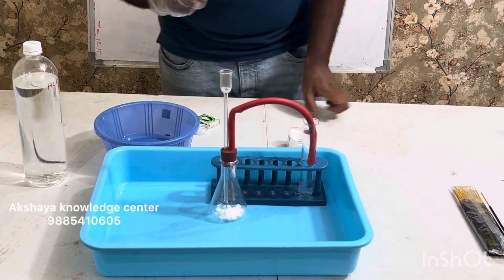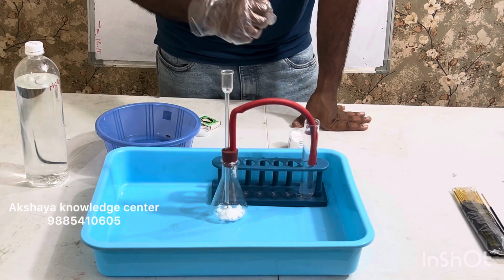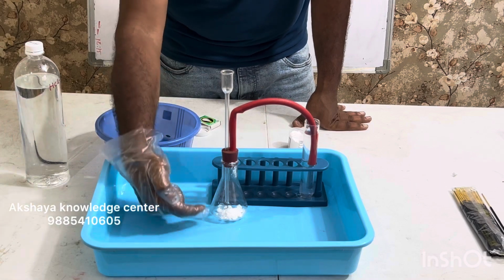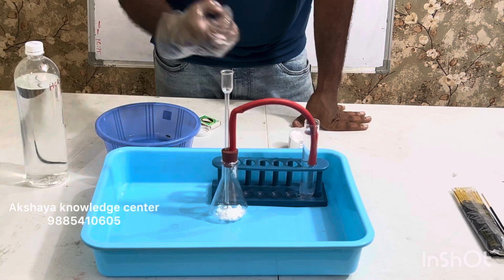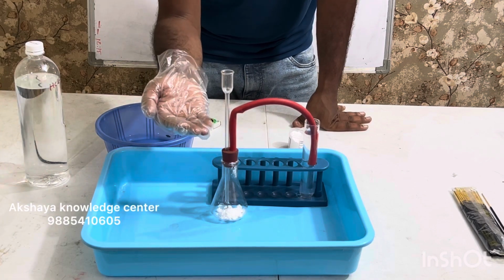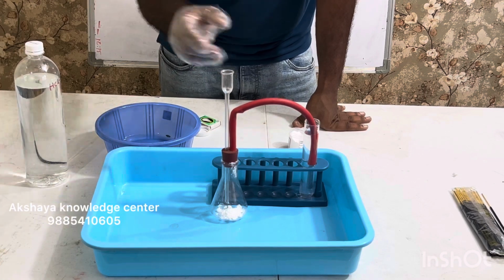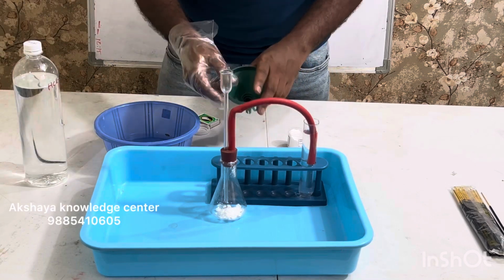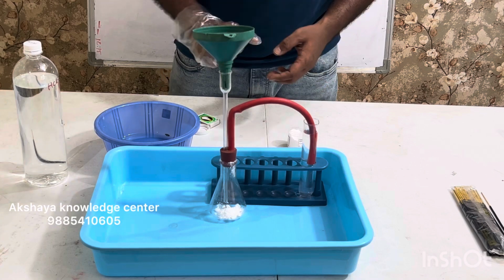You might be wondering, will there be any gas coming from the thistle funnel? Yes, there will definitely be some gas coming from the thistle funnel, but since the funnel is very, very deep into the conical flask, little gas would come out. If I keep the stem of this thistle funnel way upwards, then most of the gas would also come from this thistle funnel, which would be a problem because we are pouring acid in it. Now, for additional ease of doing the experiment, I'm also placing a funnel on top of it.